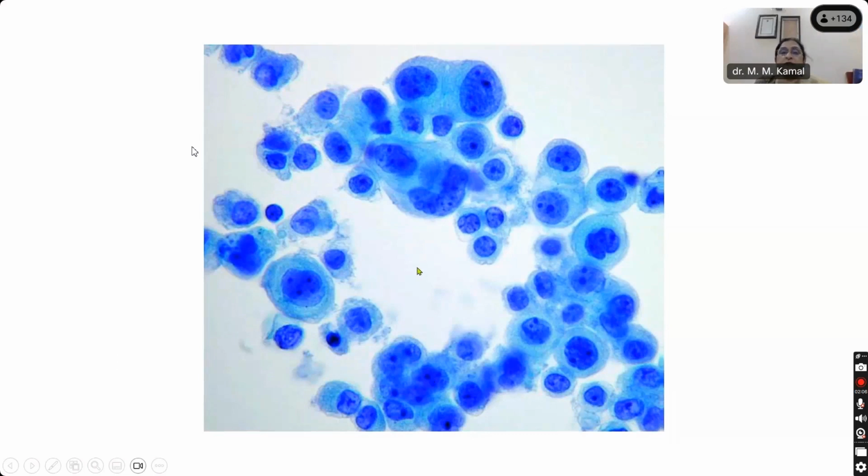Shidham's book, and he has this series of CIMA's fluid cytology books. They are very nice books. You can read them. And here you can see these mesothelia. Can you recognize them as mesothelia? Yes, ma'am. Why? We must repeat the features once again.